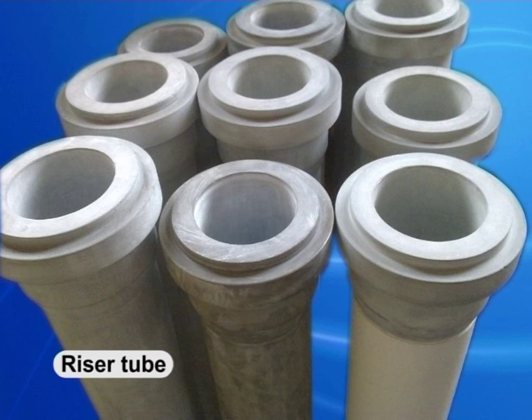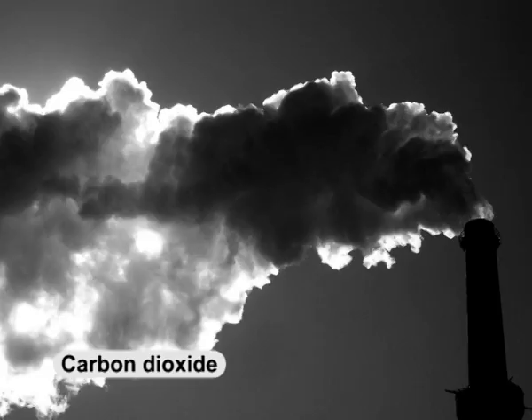This aerated medium or broth of the riser tube has a lower density, while that in the downflow tube is relatively much less aerated and as a consequence has a higher density. This density difference drives the circulation of broth. The oxygen is continuously consumed by the cells and carbon dioxide is generated by respiration.